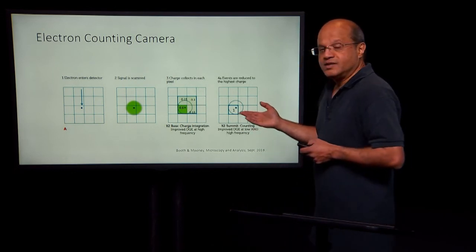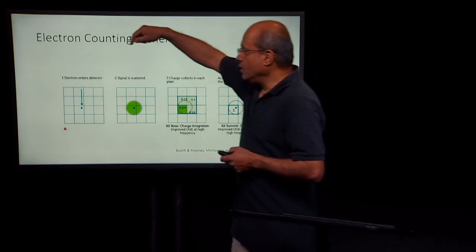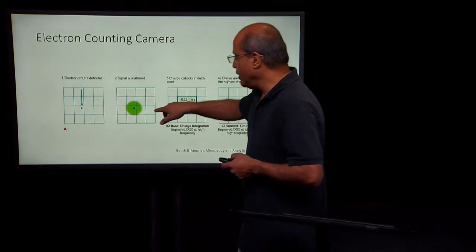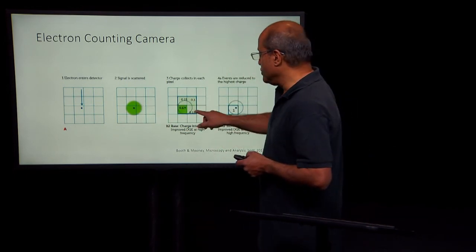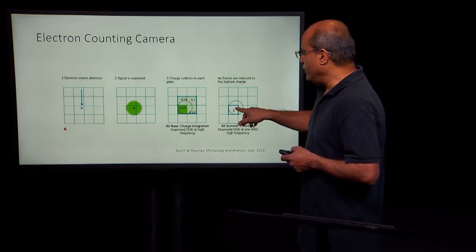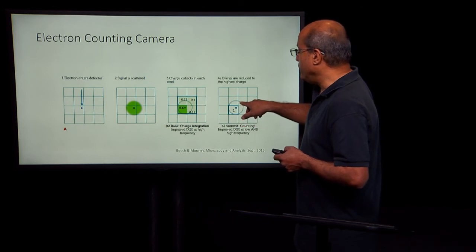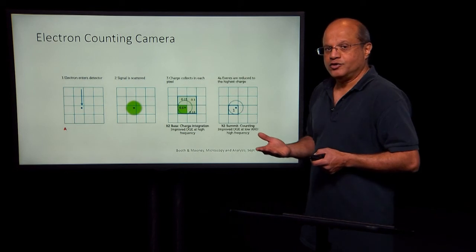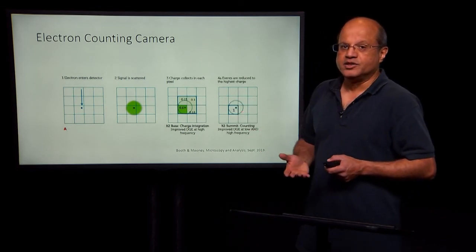But again, this is a random process, because if you were to repeat the experiment with the electron hitting the same point, the secondary electrons might have a slightly different distribution, and it is possible that the eventual allocation of charge to a pixel might end up being in some other pixel. But again, if you have lots of electrons, what you will end up measuring is the mean of all of that, and that mean is a deterministic signal.